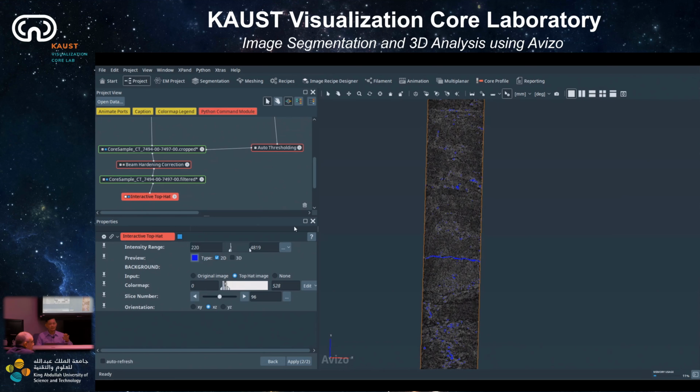So there are many ways to remove what you're asking. For example, you can remove small spots, remove islands, or you can use filter by measurement. Have you tried remove small spots?